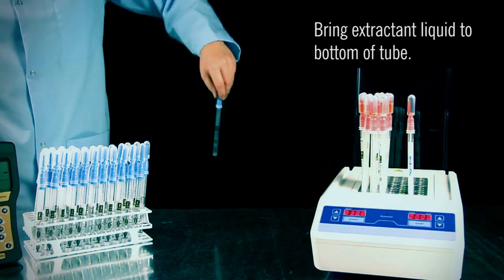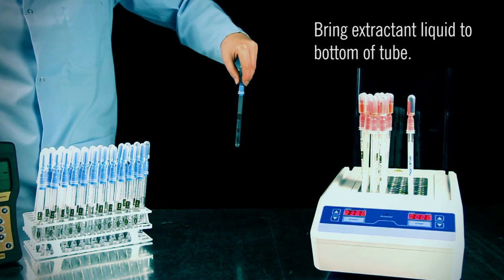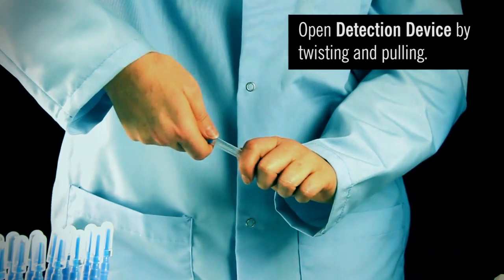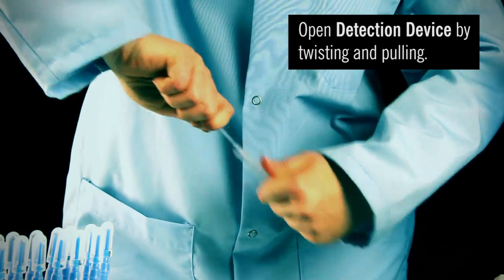Holding the swab upright, forcefully flick the device in a downward motion. This will bring droplets of chemistry to the bottom of the tube. Twist and pull to remove the snap valve from the detection device tube.